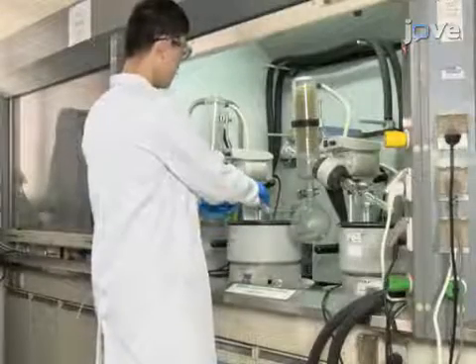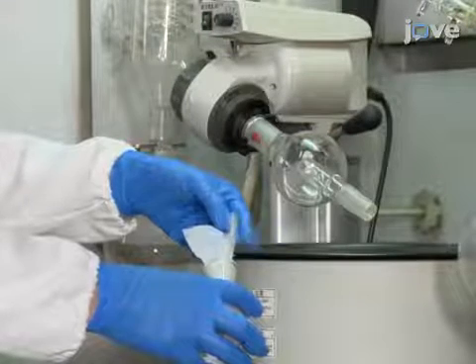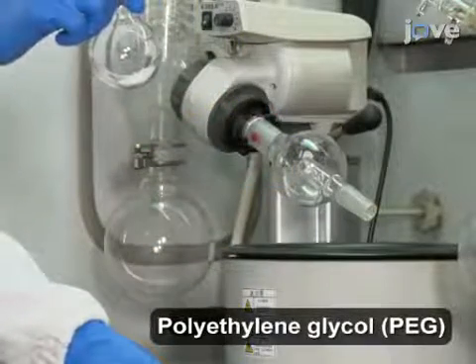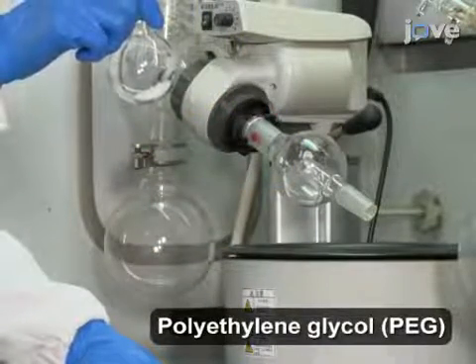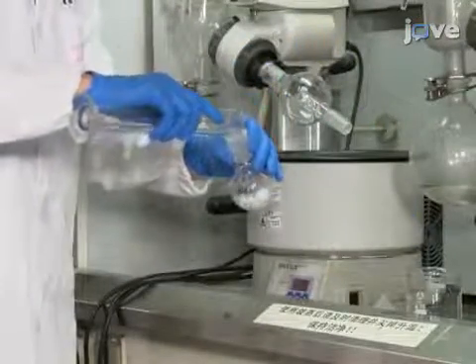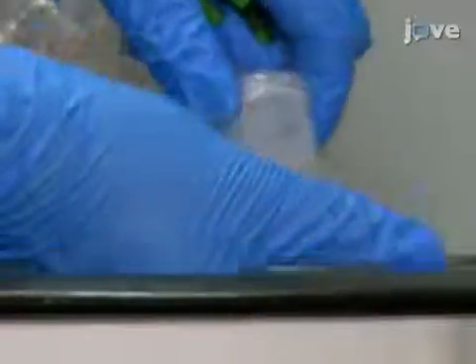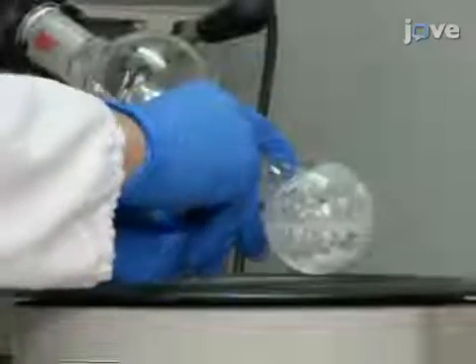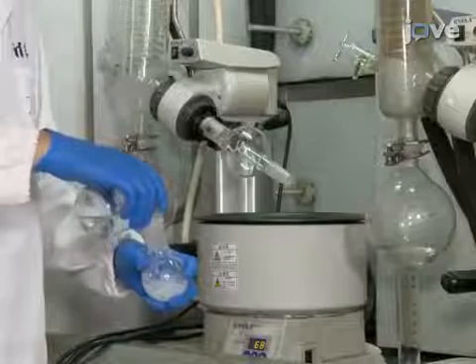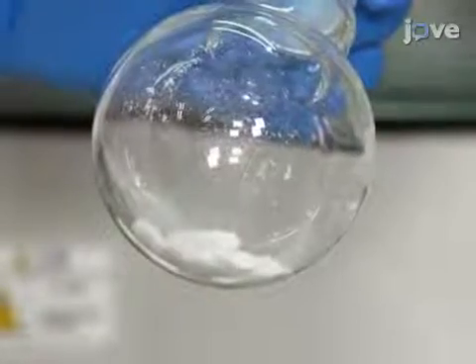To make the hydrogels, first synthesize DF-PEG. In a fume hood, weigh out 4 grams of molecular weight 4000 PEG into a round bottom flask and add 100 milliliters of toluene. Then, to dissolve the polymers, warm up the solution. After all the polymers dissolve, use an evaporator to remove all the solvents. Then repeat the process of mixing in toluene and evaporating it twice more to prepare the dry PEG polymers.